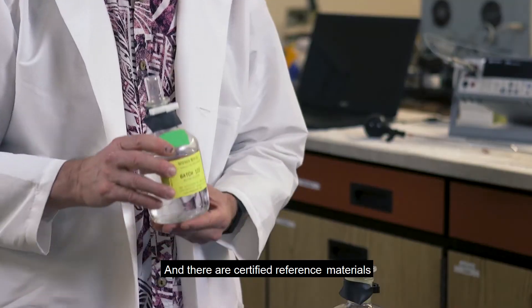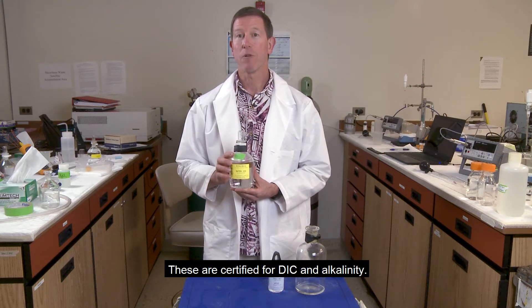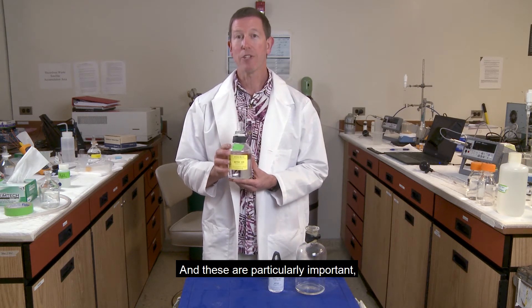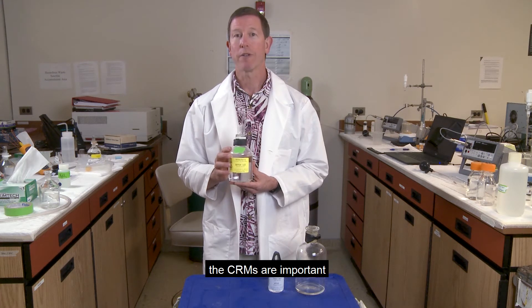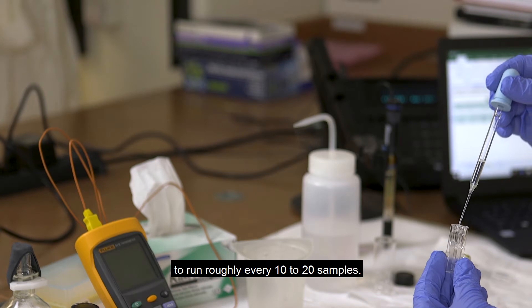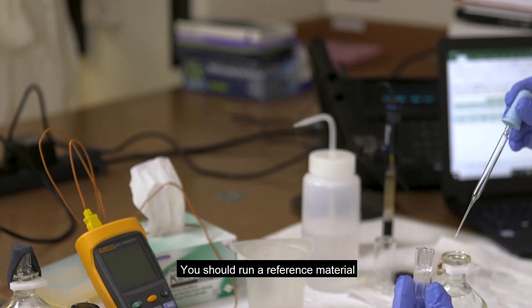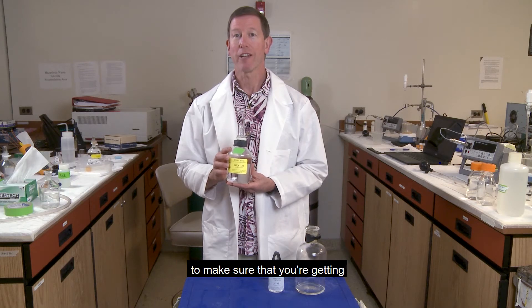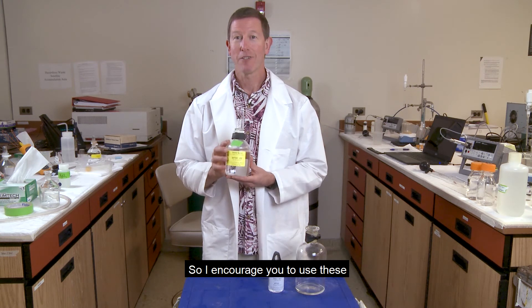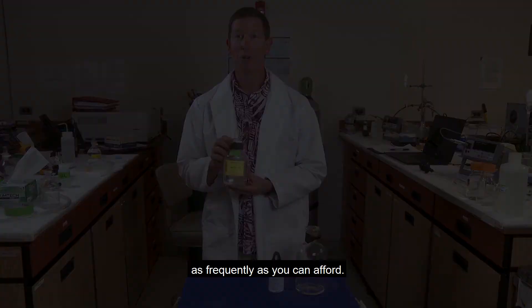There are certified reference materials available, certified for DIC and alkalinity, and these are particularly important. The CRMs are important to run roughly every 10 to 20 samples. You should run a reference material to make sure that you're getting correct and accurate results from your alkalinity titrations. I encourage you to use these as frequently as you can afford.